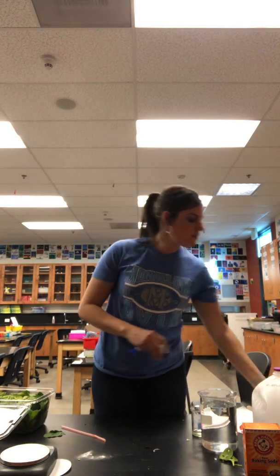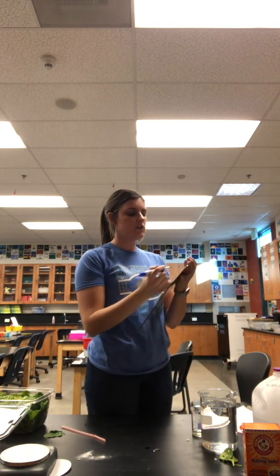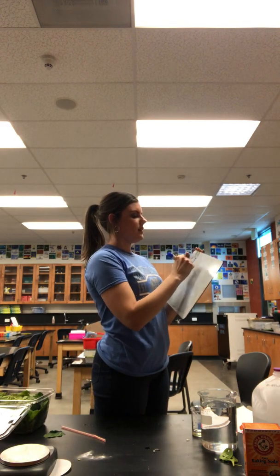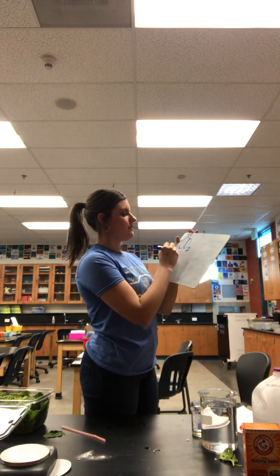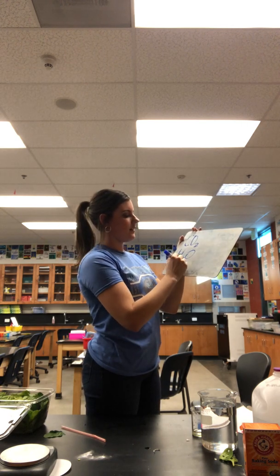Assuming that students have had somewhat of an introduction to photosynthesis in our class the few days prior, we as a class should be able to describe and list the inputs and outputs of photosynthesis. For the purpose of this lab, I'm going to focus on the inputs because that's what we're going to be manipulating to change the rate of photosynthesis. Students should be able to list the inputs as carbon dioxide, water, and light.